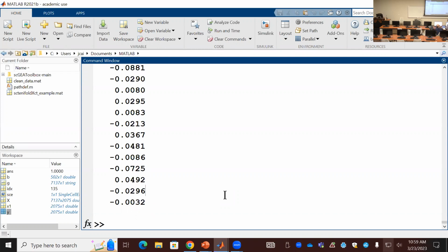Okay, I see. Then you should use this, I believe. You can see violin plot. Oh, you don't have violin plot here. Oh, you want to see it for each gene. Previously, it worked. Really? Okay, new version. You can copy this to me, and then I will fix that.